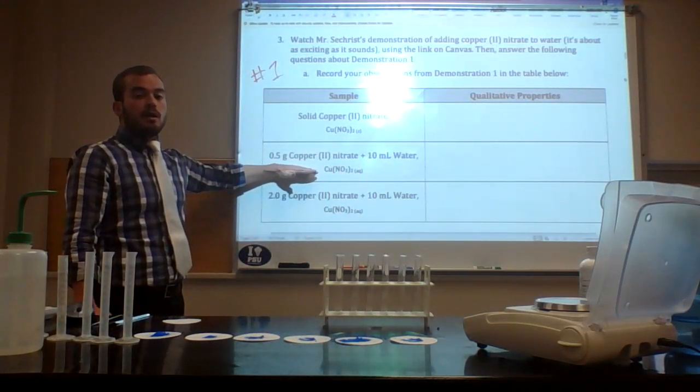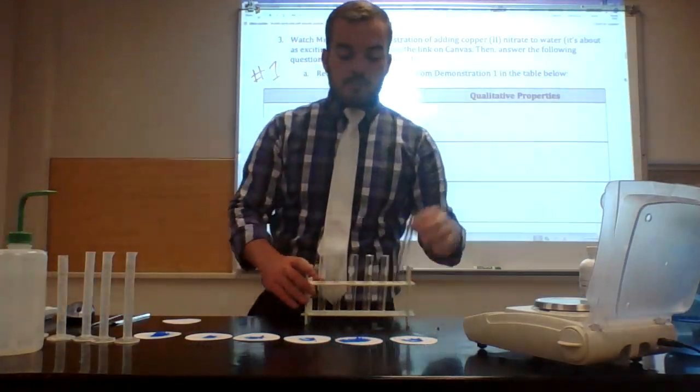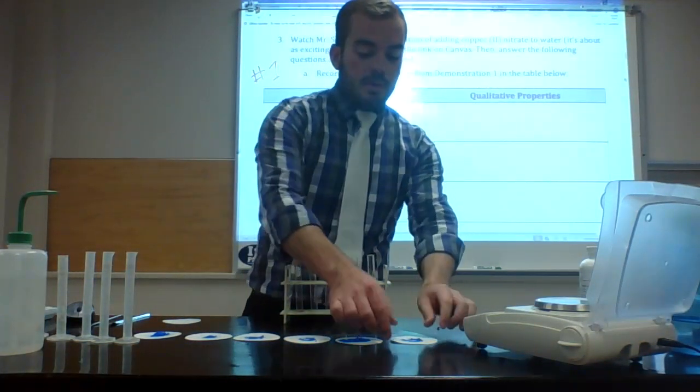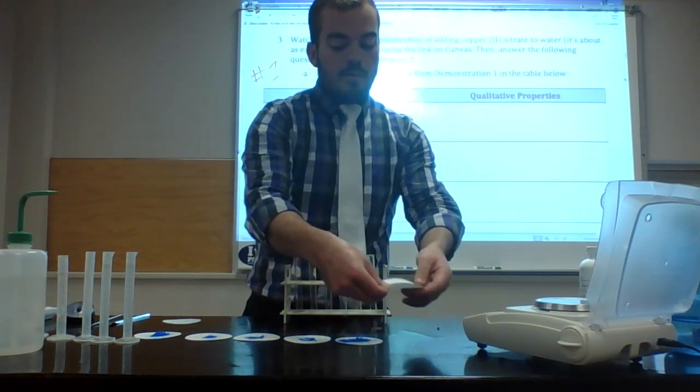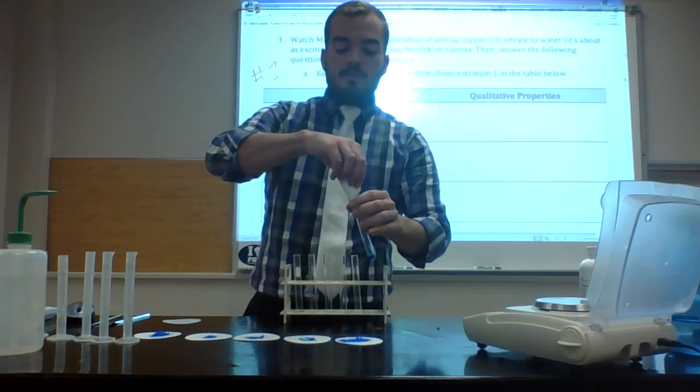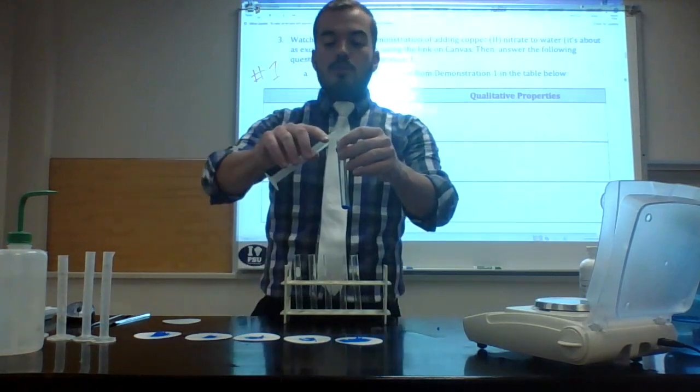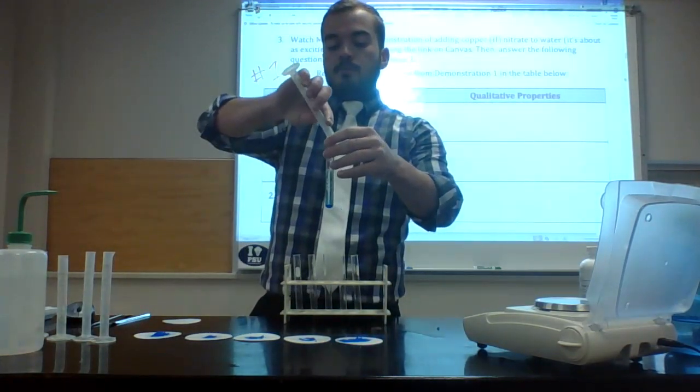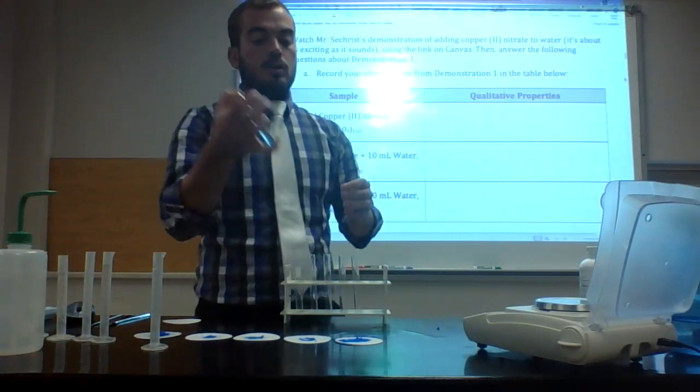So that's copper(II) nitrate. We're going to make several solutions of this. The first one, I'm going to take 0.5 grams of copper(II) nitrate and add it to 10 milliliters of water. I'll just put it in this test tube, add my 10 milliliters water, and shake it up.